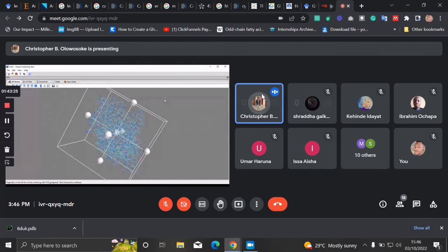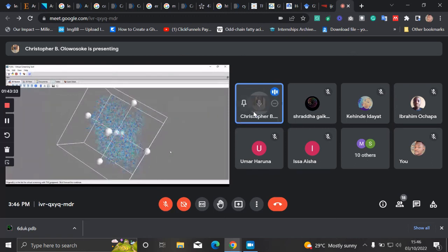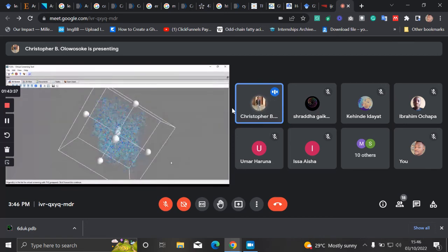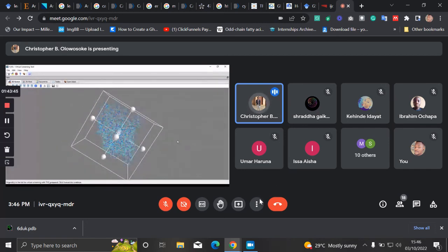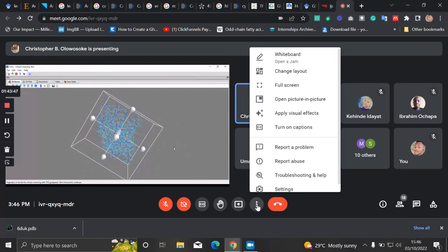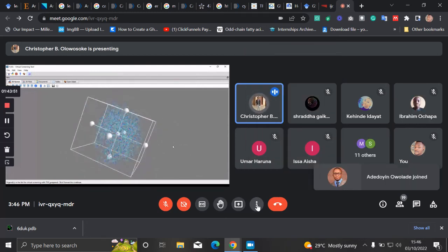So it will not even hinder the function of the protein or the enzyme. So we need to identify the active sites with which this ligand, the native ligand in the body, interacts for this protein to carry out its function. Because if we do not identify the active sites, the essence of our docking will not be achieved. So we have to identify these active sites.